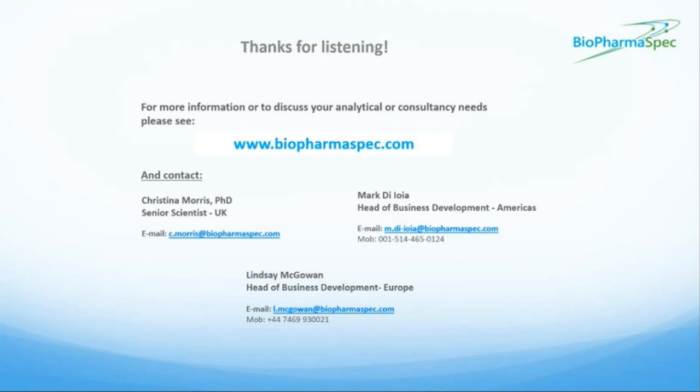Thank you. Our next question is, are these MS methods acceptable to regulatory authorities? Right, so in our opinion, the MS should be used as an orthogonal method, so it's an orthogonal approach. It does have the sensitivity and depth to identify differences with the HCP profile, and we would say really that it's probably best to use alongside an ELISA, for example, and to provide the broadest degree of coverage.